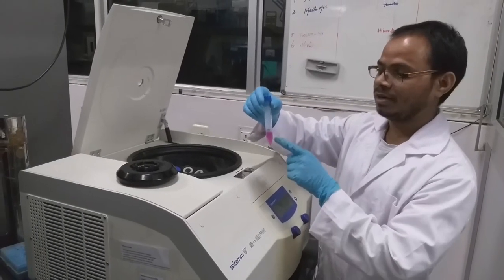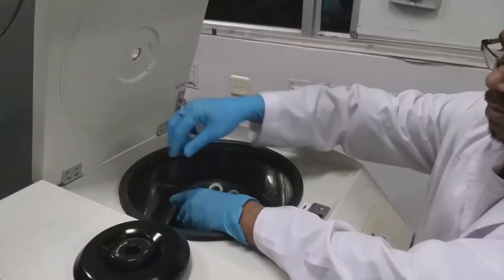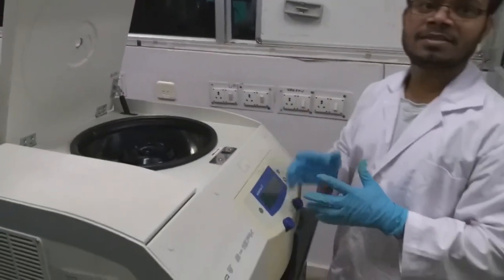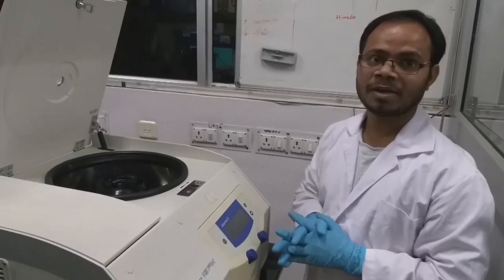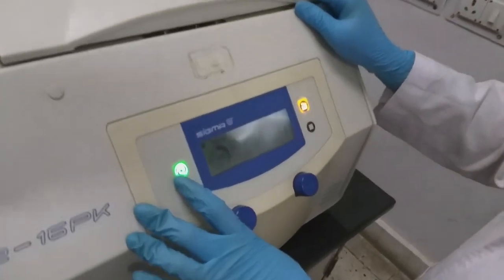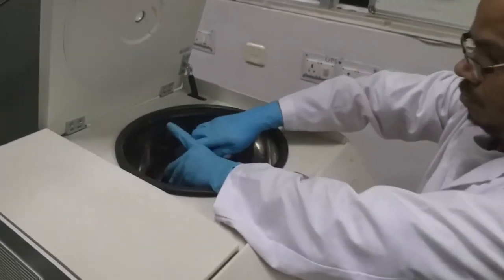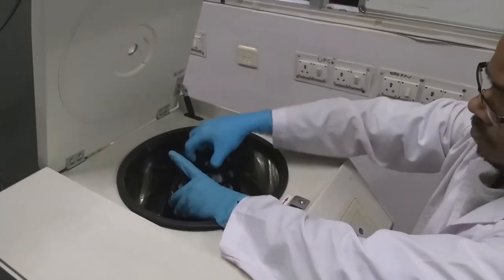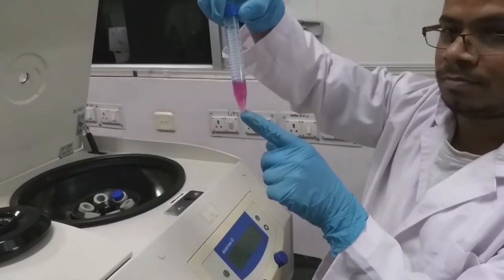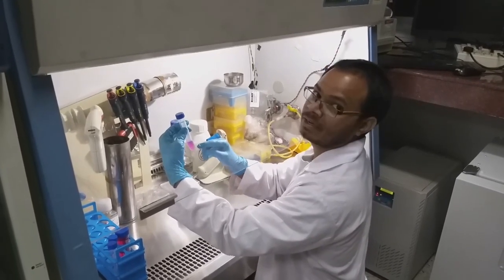After cells are detached, we have taken them into a clean falcon. Then we have to centrifuge the cells. As these cells are very delicate, we have to centrifuge at 1500 rpm for 2 minutes. Now we have to remove the supernatant and resuspend the cells in fresh media.